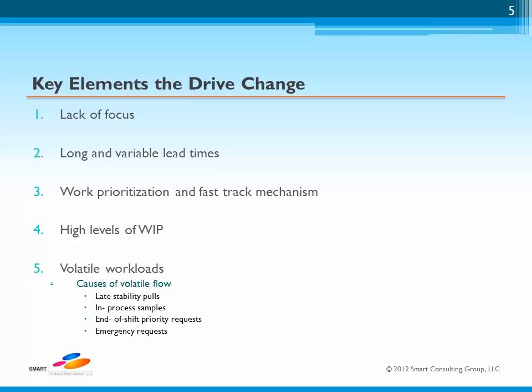A fourth point is in relation to high levels of work in progress. Often QC laboratories are highly stressed work environments where a lot of samples require processing in a relatively short period of time. Frequently, this results in high levels of work in process, or WIP, which result in efforts to label, track, and prioritize and assign work functions. In an attempt to solve this, sample analysis tools have been deployed, often with elaborate IT components, to address sampling. But these only seem to work until the next level of complexity is in, and then the same old issues raise their heads and waste and inefficiency increase.